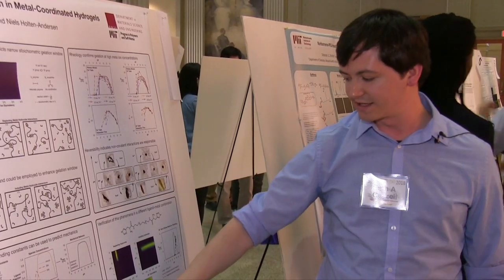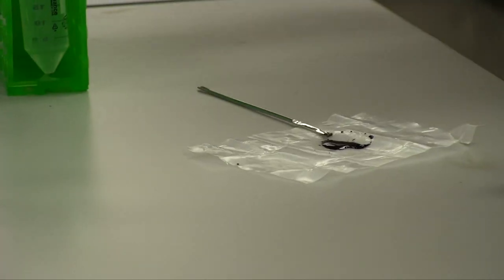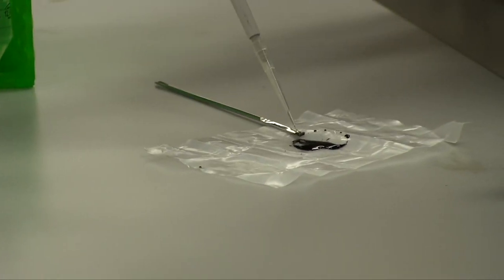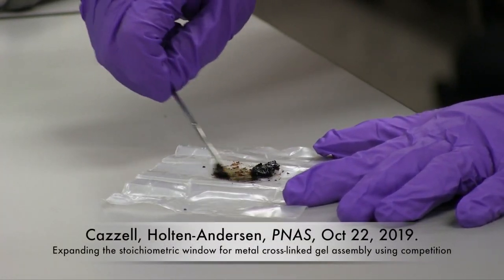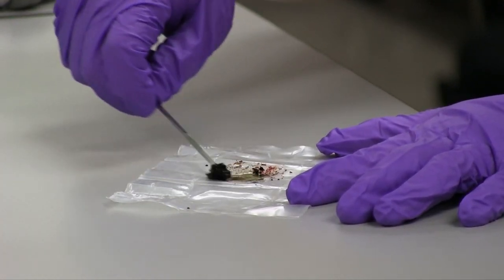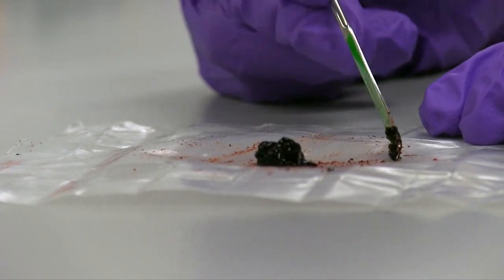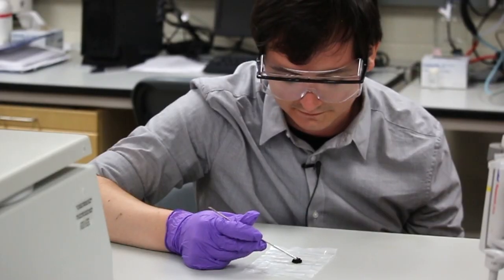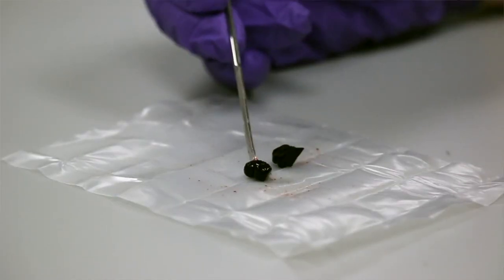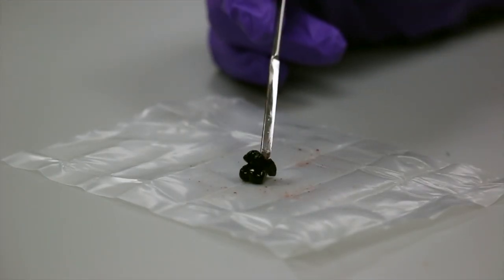We took a single gel and cycled it up and down and up. So we've lost our gel — let's see if we can bring it back. You're able to cycle these to show that it's a very reversible reaction. It's a huge change in the mechanical properties with just a little change in the pH of the gel.